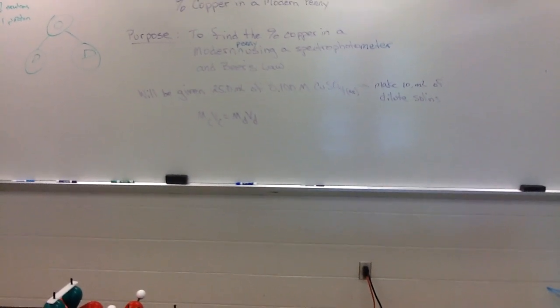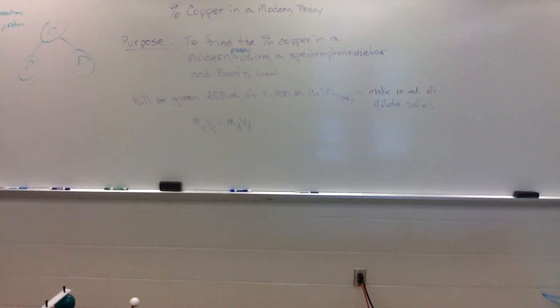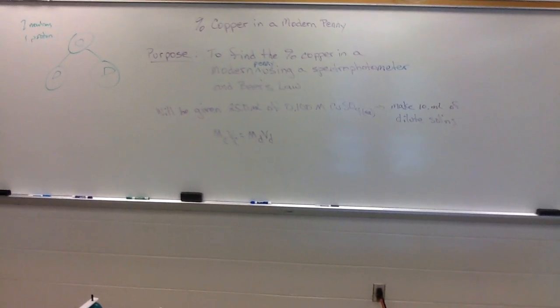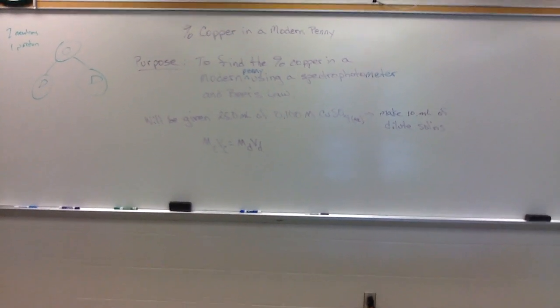Okay? The molarity of the dilute is what each person is going to decide. What molarity do we want our different solutions to be, so we can graph it and then figure out our straight line equation, and then from that figure out the unknown. Okay? So now let's go look and see what's happening in the lab.